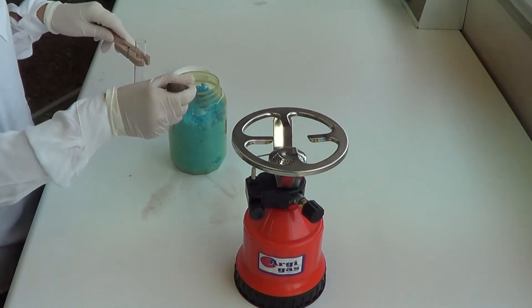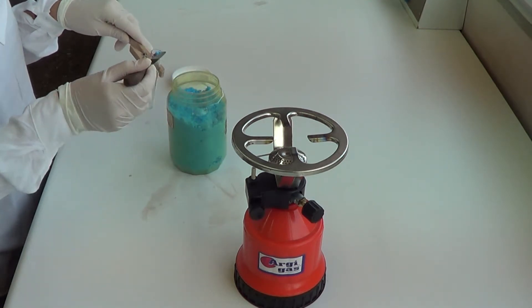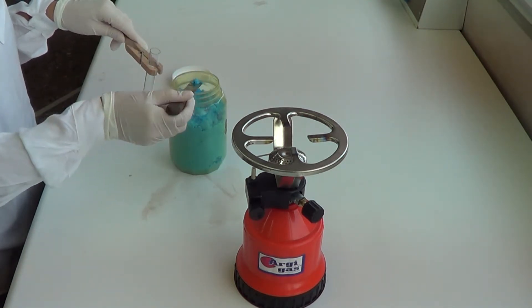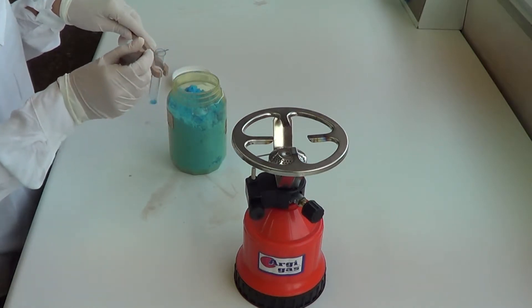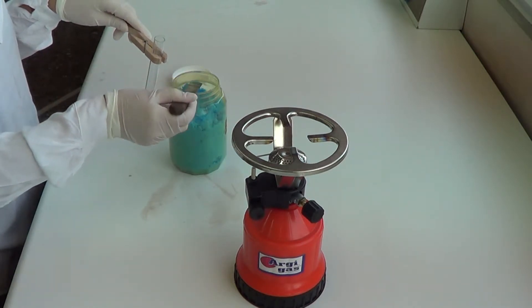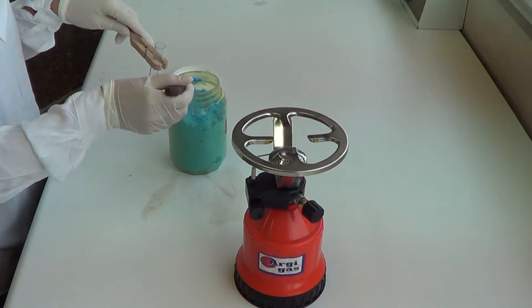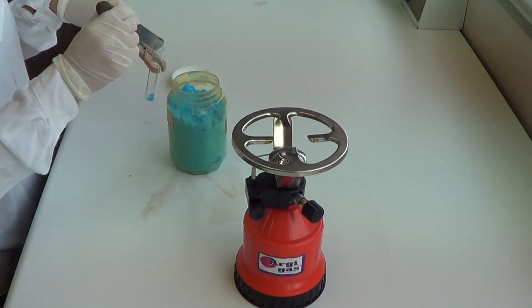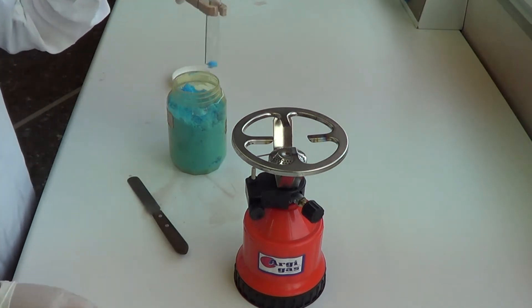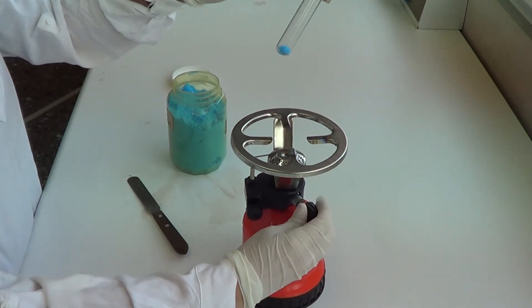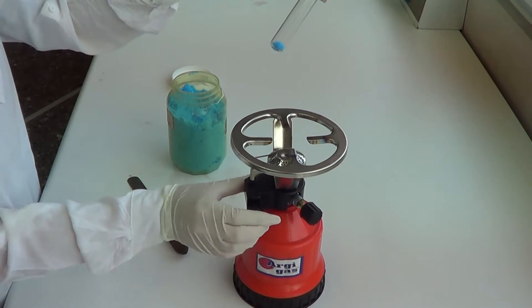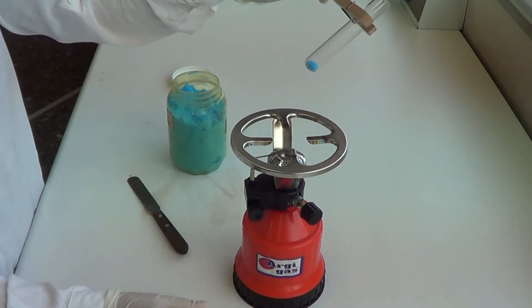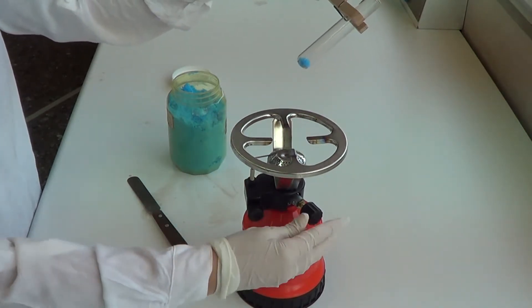In a glass test tube, we place about 10 grams of hydrated copper sulfate. Then we approach the test tube to a lit flame, taking care not to turn the test tube toward us or any other person.